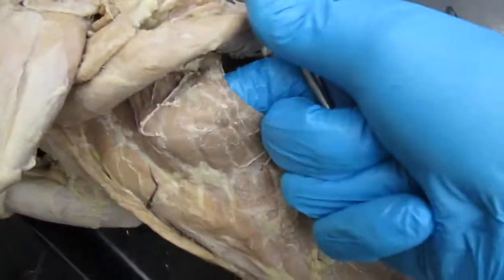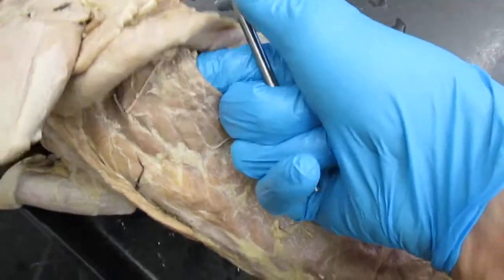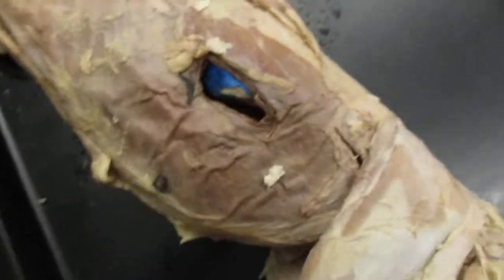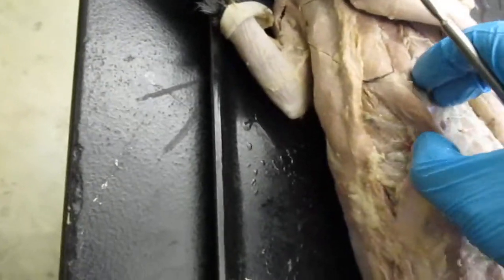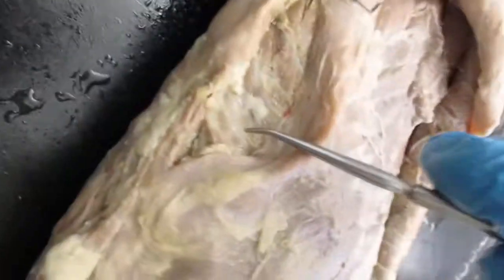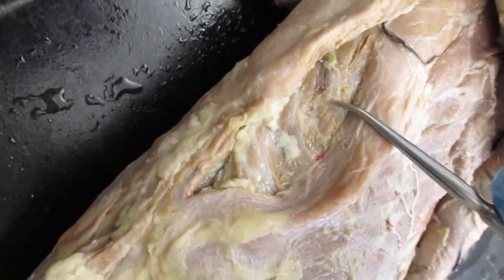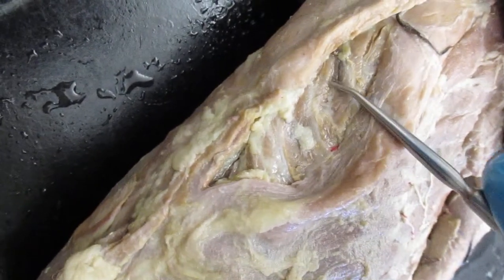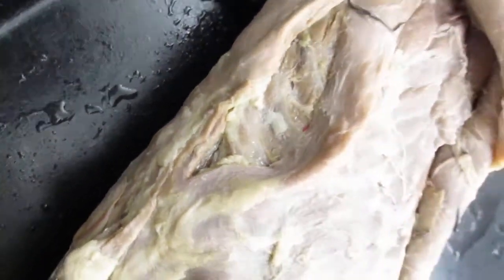If you look right here, we can see the serratus ventralis muscles right there. Okay. Next, we have the intercostal muscles, which can be seen really good right through here. So we see the ribs right here. There's one rib, there's another rib. In between the ribs we have the intercostals.